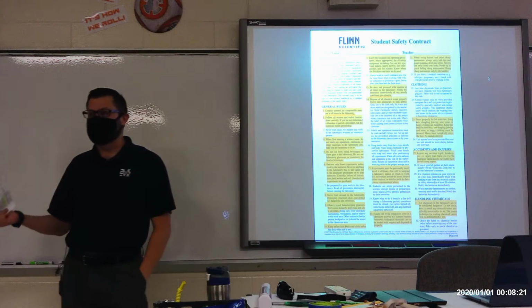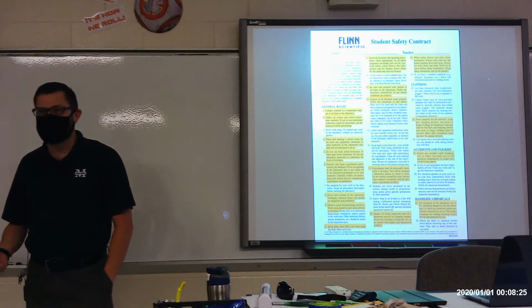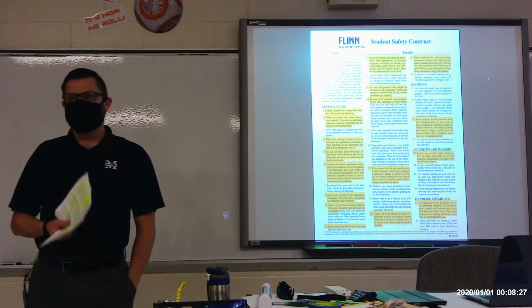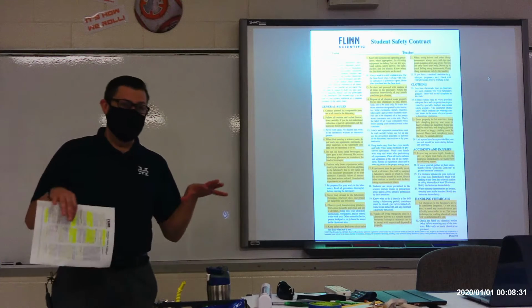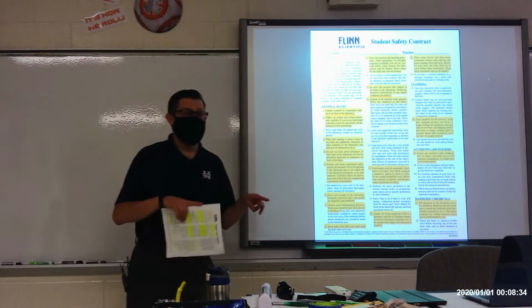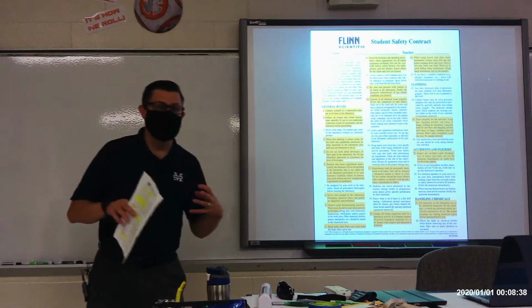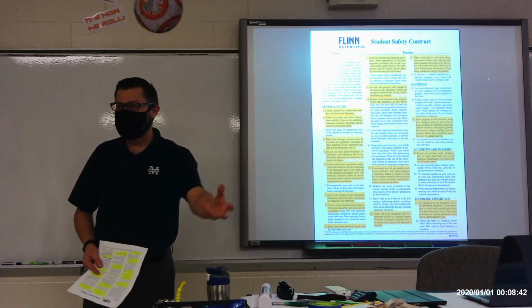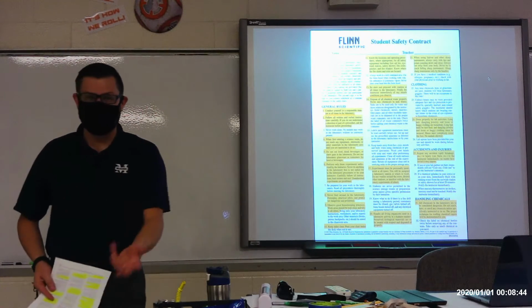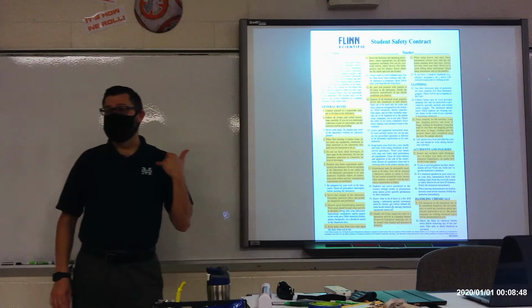In a laboratory setting, which this classroom is also a lab, you shouldn't be eating or drinking just in general, because quite frankly, you never know what has last been on the desks in here. If my previous class was doing a dissection and you're sitting there munching away on something, you might be getting the frog juice left over from the previous class on your food and now in your mouth. Not a fun time.